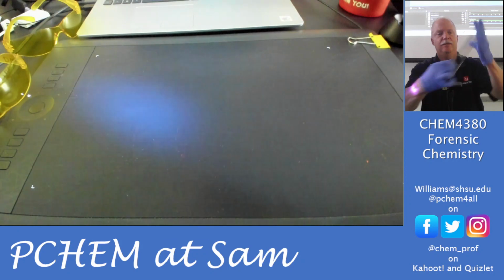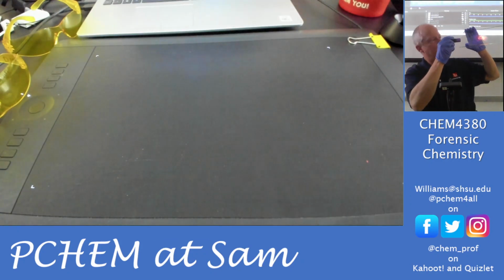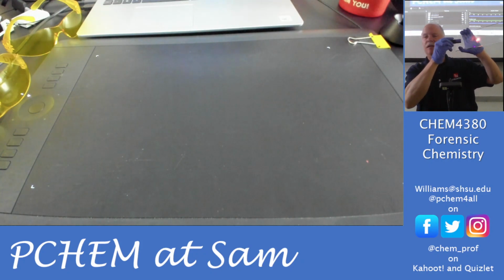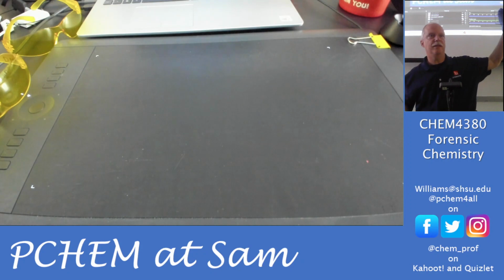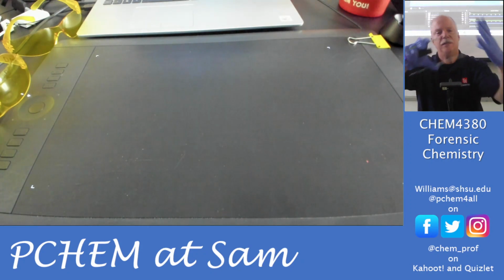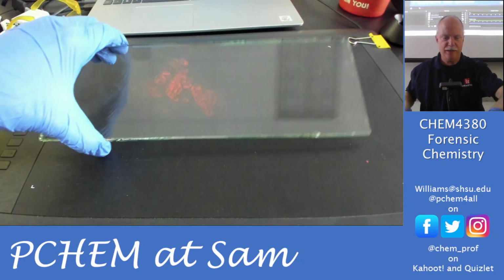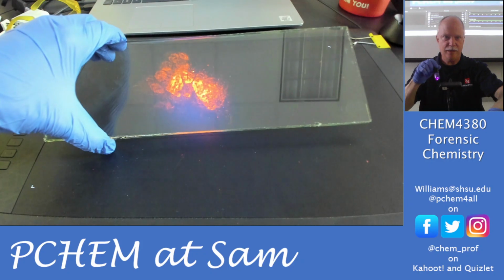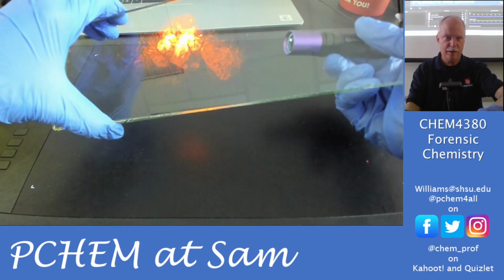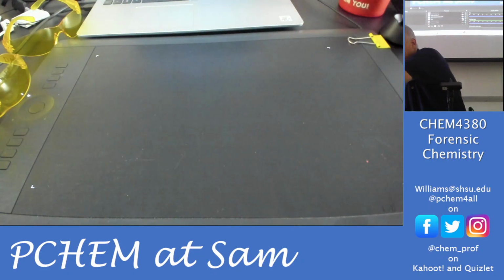So maybe I can show it to you like this. Yeah. But you can see how bright that is with this UV light. And it really stands out. Without it, you just see a greasy smudge on the glass. So again, that's giving us contrast. There we go. You can barely see it. You shine the light on it, it really stands out. I see from behind. Yeah, there we go. All right, so this.